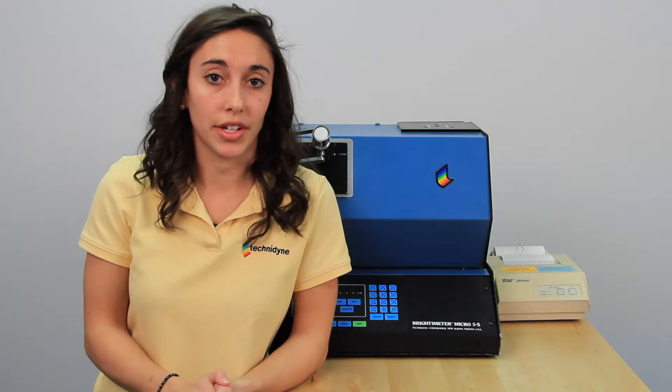Today we're here to talk about Technodine's Micro S5 Brightness and Color instrument. An important thing to remember about this instrument is that it needs to warm up for about 30 minutes prior to any usage. So while our instrument warms up, I'm going to show you everything that you'll need in order to do your calibration.